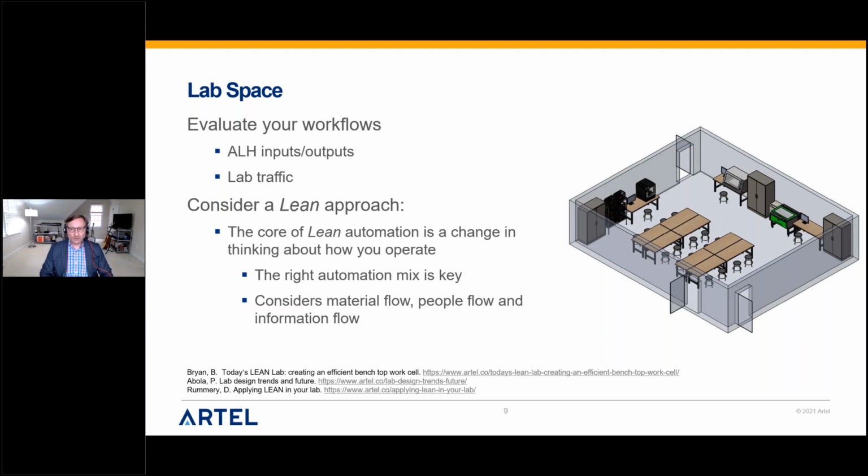So you want to make sure that you're set up for that: there's appropriate bench space next to you where you can have a staging area to put your equipment and reagents. You need to think about lab traffic too. Just because I have an open bench over here, that's fantastic, but if you have a lot of people normally walking in and out, if it's by a main door, that could cause a disruption. It could cause airflow disruption. So you want to think about those kinds of things.